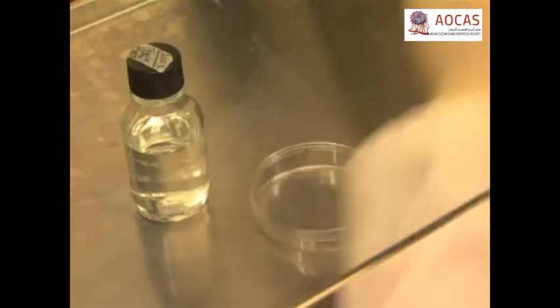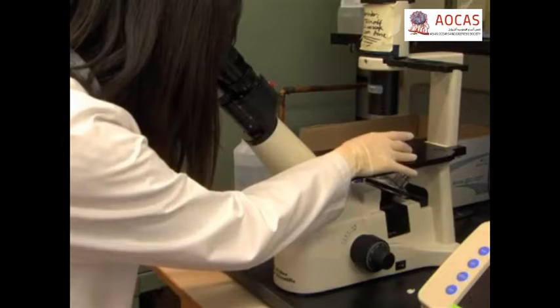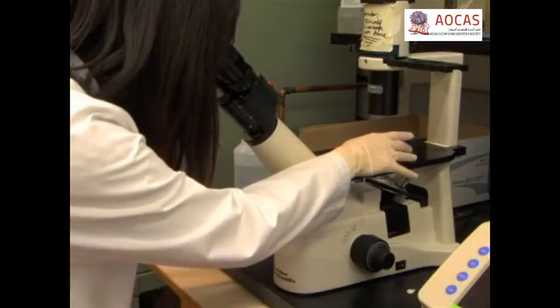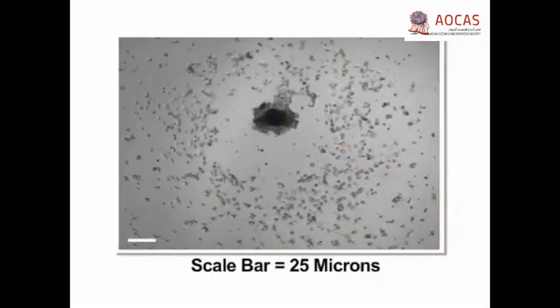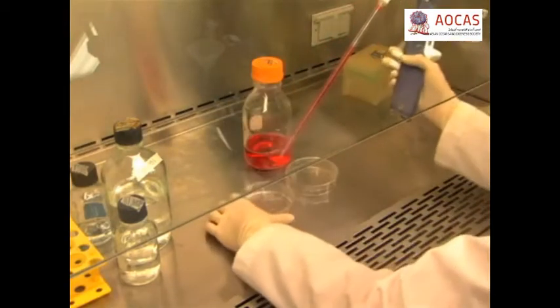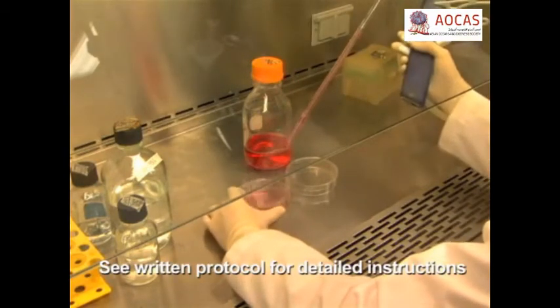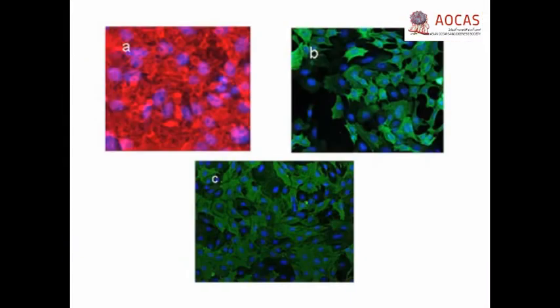Separate the fibroblasts and epithelial cells by selective trypsinization. Fibroblasts are more loosely adhered than epithelial cells — check for fibroblast detachment under the microscope after 2 minutes in trypsin. Cells should be floating in suspension or rounded up while epithelial foci should still be adhered to the surface. Re-plate the suspended cells onto collagen-coated 10-centimeter dishes and repeat the selective trypsinization process until fibroblasts and epithelial cells are completely separated. Check for cell purity by immunofluorescent staining for epithelial markers such as CK14 and CK18, and fibroblast markers such as alpha smooth muscle actin.